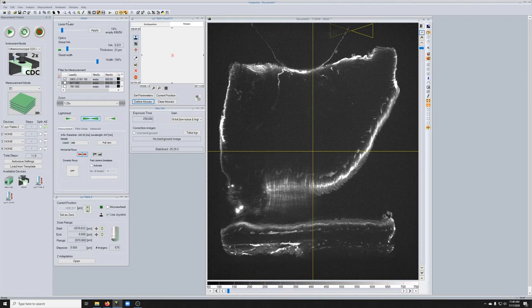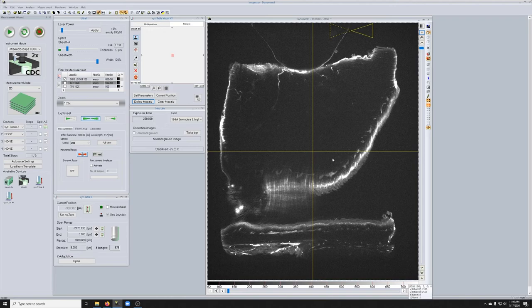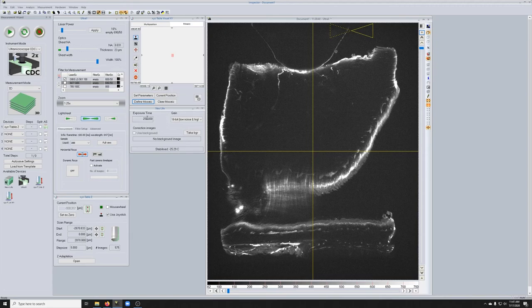If we were to increase the laser power and just leave a high laser power on the sample for many seconds as we're moving around, that could lead to bleaching of sheets of the sample. We want to avoid that. So what we do instead is we adjust the signal to noise by adjusting the exposure time to the level that we want.